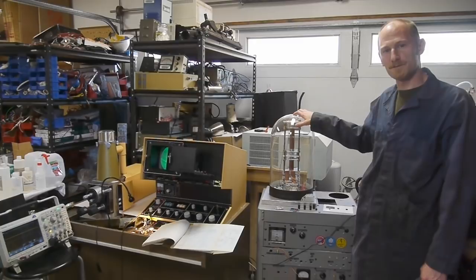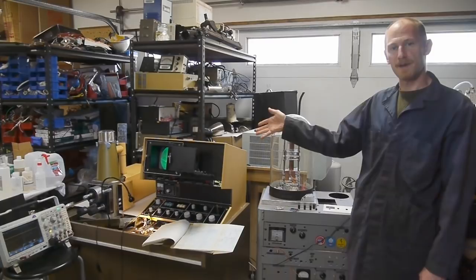Check out my scanning electron microscope collection. This is the SEM that I built myself a couple years ago, but the newest addition is this JEOL JSM T200.